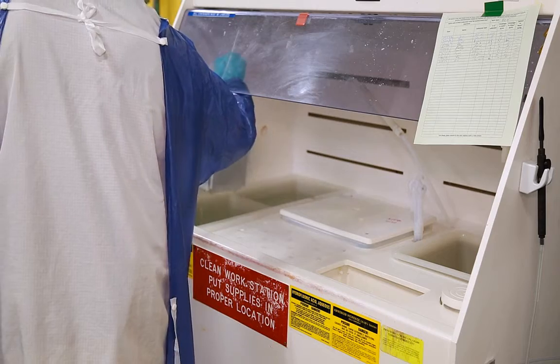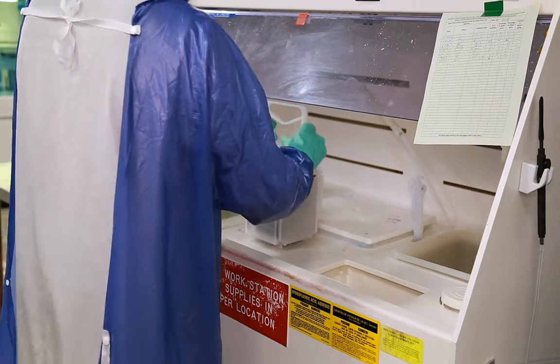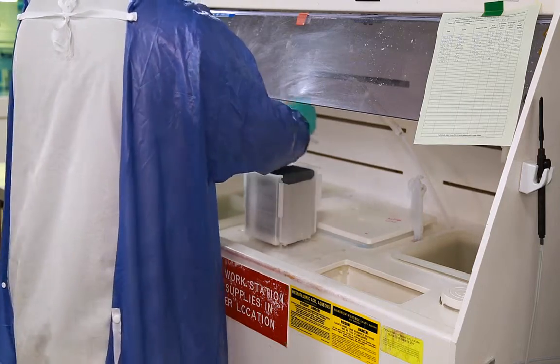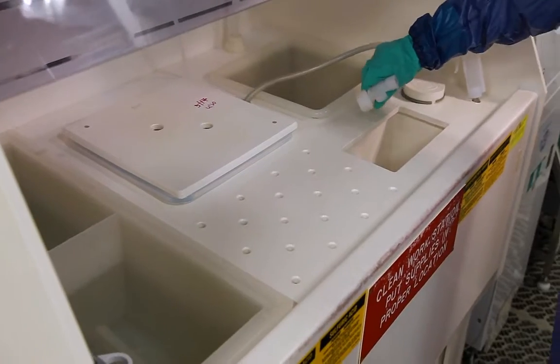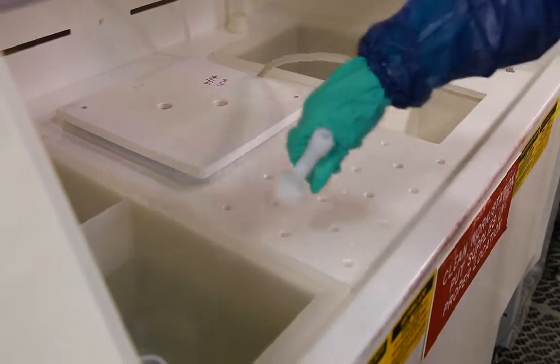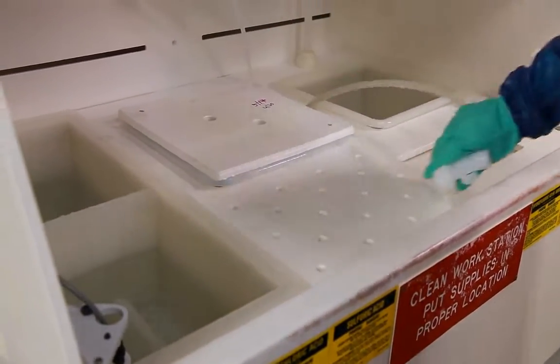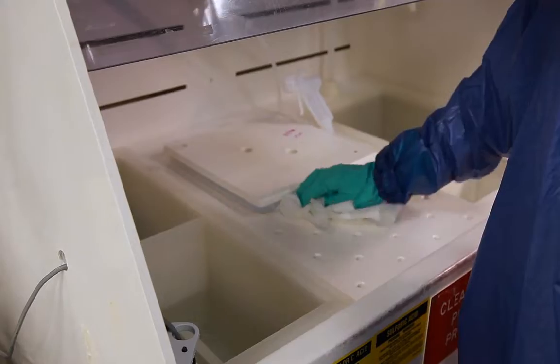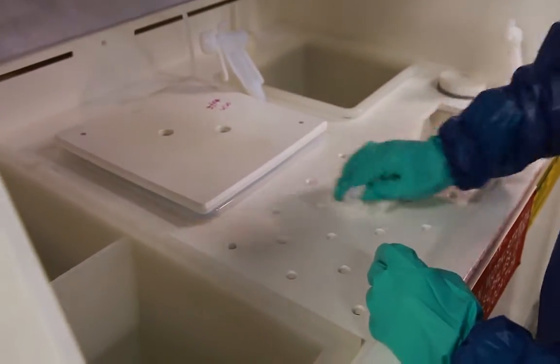When working with HF, maintain a healthy respect for HF hazards, even when following a rinse step in your procedure, as HF may still be present on any and all surfaces. If you are working with HF at a wet bench, use the available water nozzle to spray down the work area. When collecting HF waste, verify the contents added are compatible. Clean up your workstation immediately upon completion of your work, ensuring no residue remains.